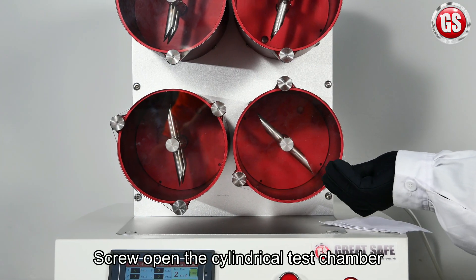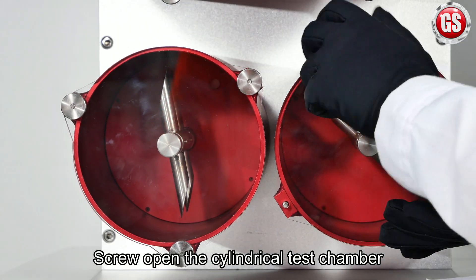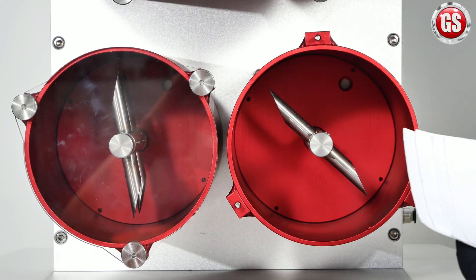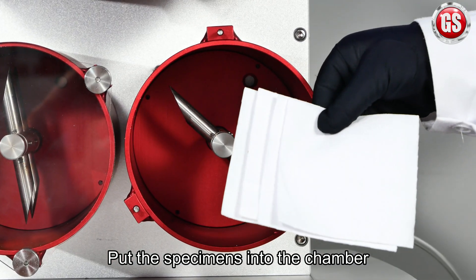First, screw open the cylindrical test chamber, then put the specimens into the chamber.